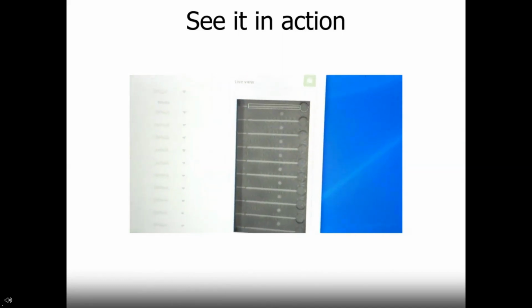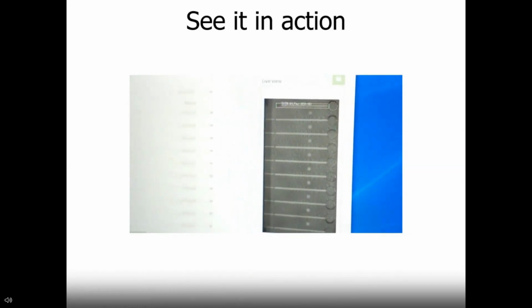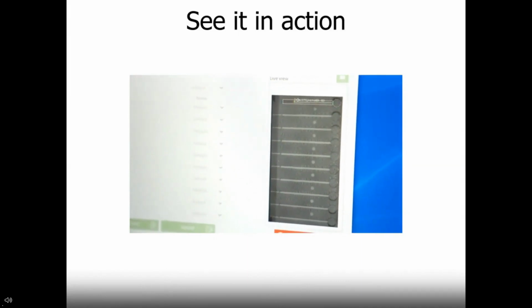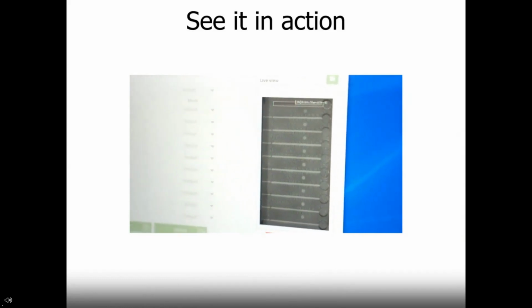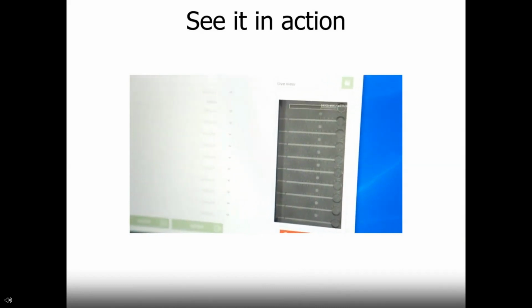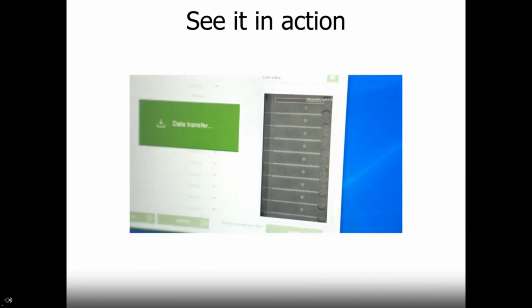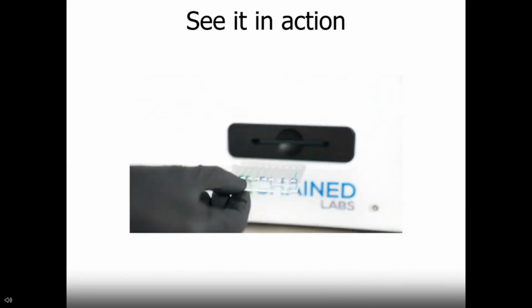After the incubation, what we'll see here on the left is that sample is going to run through the resistance channel and then start being tracked by the software, just like we saw in the earlier video on the last slide. So this whole run, because it's on a sample that is less than 10 centipoise, takes about 1 minute, and that includes the 20-second incubation that we saw. When the sample reaches that line of circles, then it's completed its run. All of the velocity data has been tracked, and the instrument's going to calculate viscosity from that pressure versus flow rate curve. All we do then is again pop the bun back out of the instrument, and we're done.